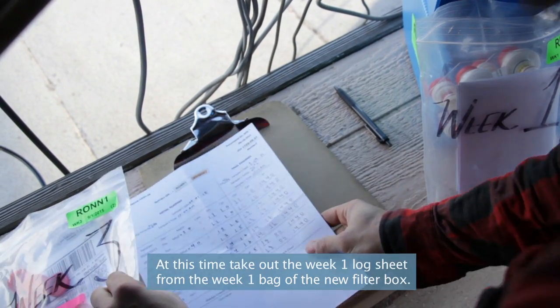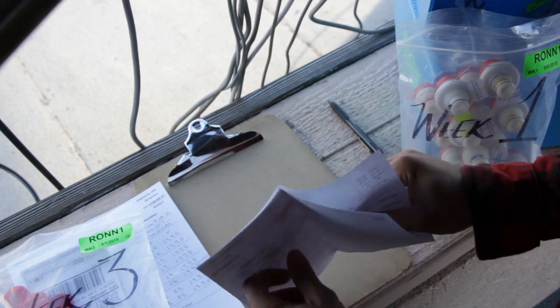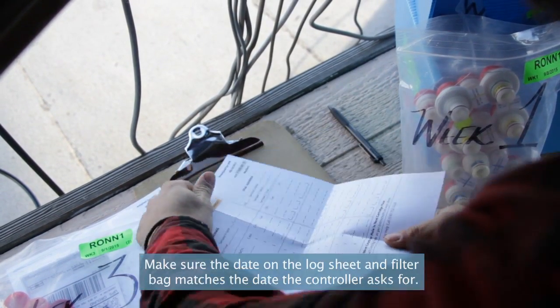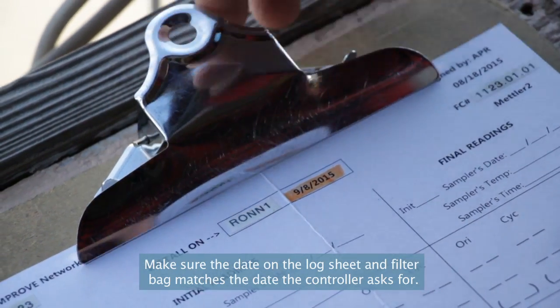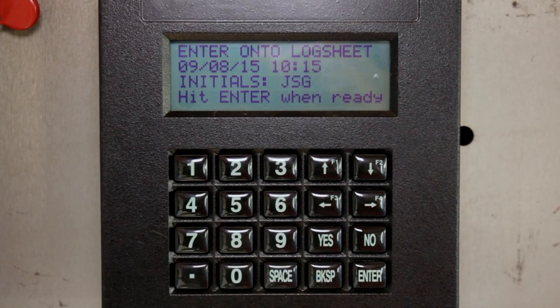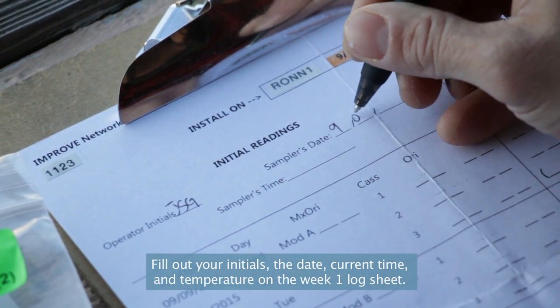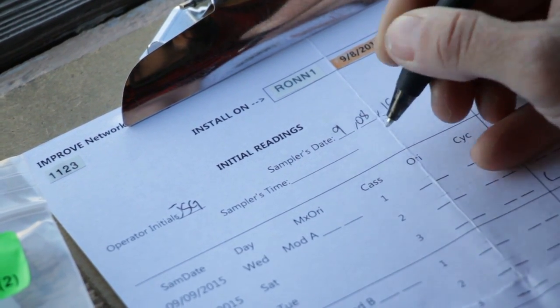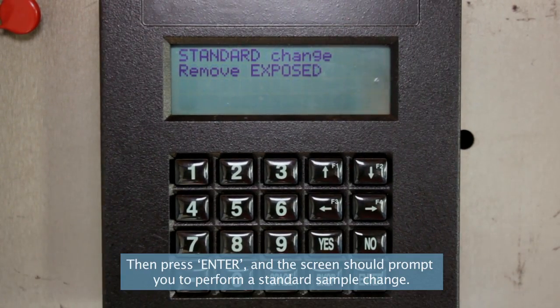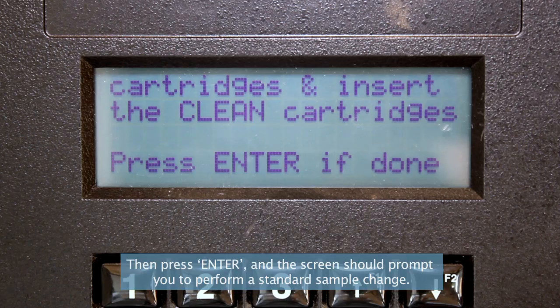At this time, take out the week 1 log sheet from the week 1 bag of the new filter box. Make sure the date on the log sheet and the filter bag matches the date the controller asks for. Fill out your initials, the date, current time, and temperature on the week 1 log sheet. Then press enter, and the screen should prompt you to perform a standard sample change.